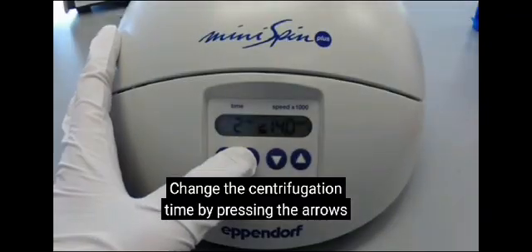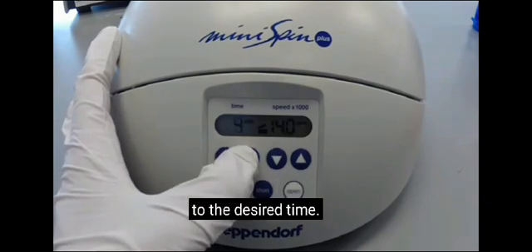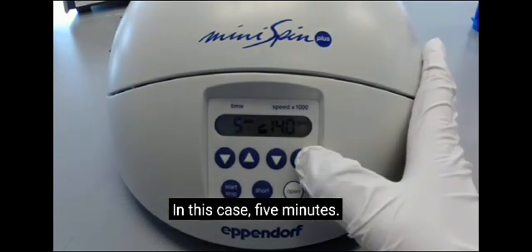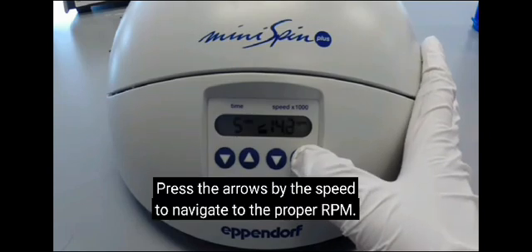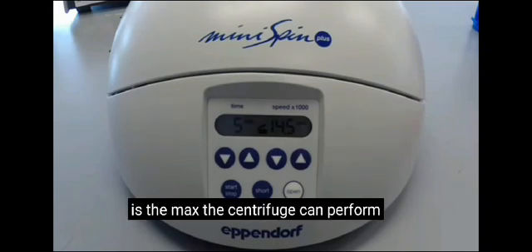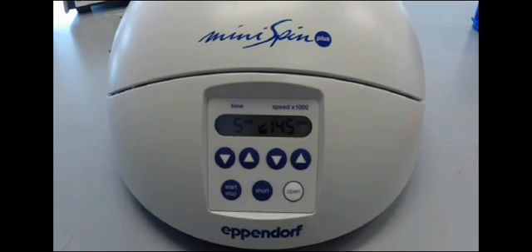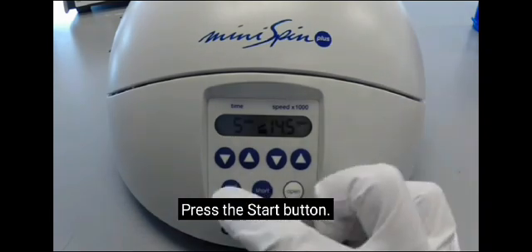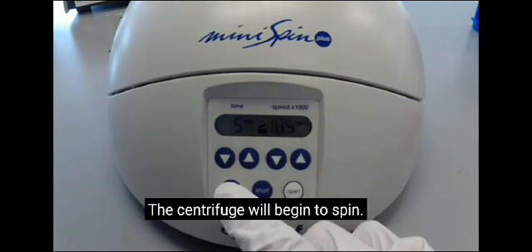Change the centrifugation time by pressing the arrows to the desired time. In this case, 5 minutes. Press the arrows by the speed to navigate to the proper RPM. In this case, 14,500 RPM is the maximum the centrifuge can perform and is close enough to our desired speed. Press the start button. The centrifuge will begin to spin.